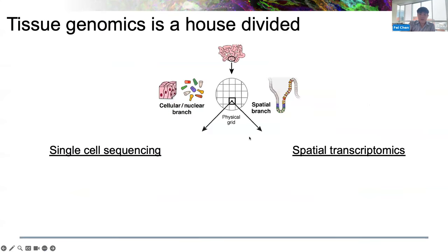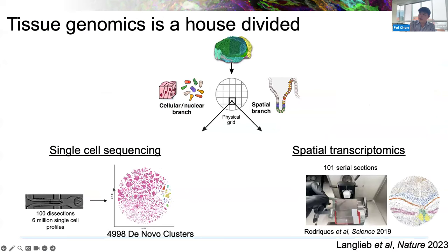But today I'm going to really tell you about this idea for bridging the world of single cell and spatial. This is actually from the Human Cell Atlas white paper. The idea, as you saw in a couple of the previous talks, has been to take a piece of tissue, dissociate it maybe, and do single cell sequencing. And another branch can go and do spatial transcriptomics and then integrate these two data. In fact, we did this for the mouse brain, for example, to generate a complete atlas of the mouse brain.